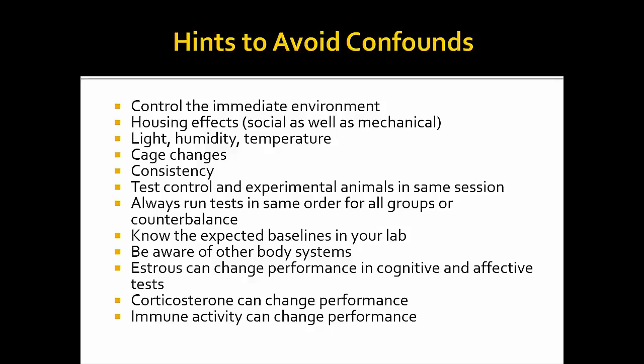You need to make sure, for whatever reason, was there no food in the cage? How long did the animals go without food? You might want to make sure that when you test them, if something is off, is it because they didn't have food, or their water bottles leaked? Were they in a wet cage all weekend? Secondly, do you run your animals in the same order, or do you randomize your animals?